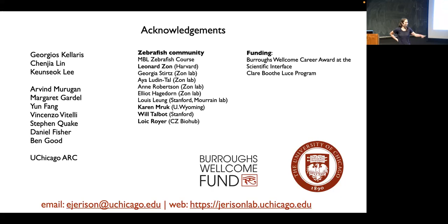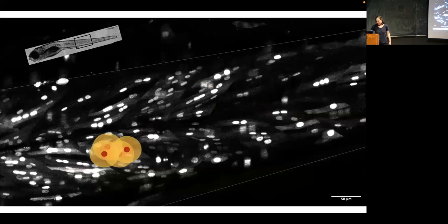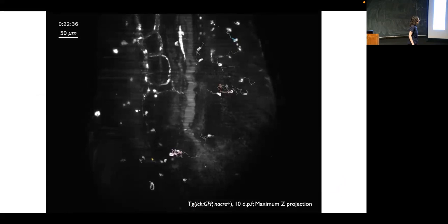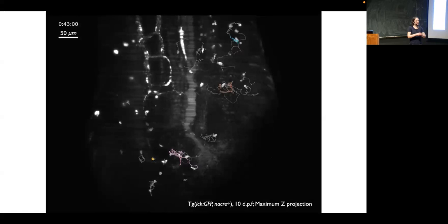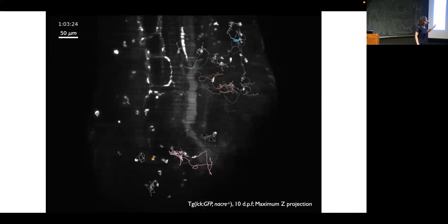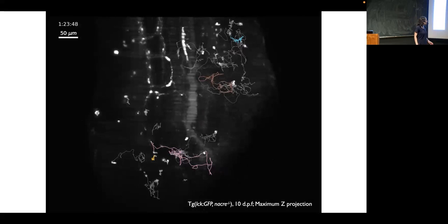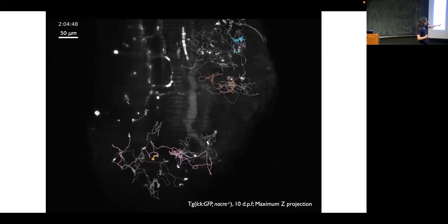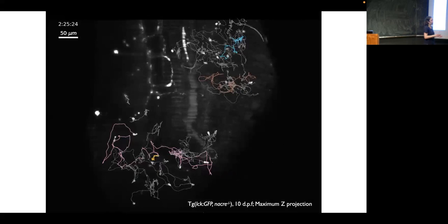Professor, can you take us back to the slide in which you showed the track of cells moving around in the tissue? Sure, happy to. And the question is, is that motion strategic at all, or do they move around randomly? Basically, they are doing some kind of random walk. What we believe is that the behavioral patterns of the whole group of cells are tuned so that eventually they're able to find things. But individual cells are essentially making random turn decisions.